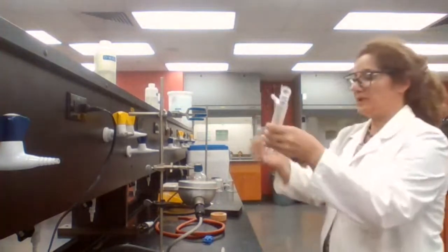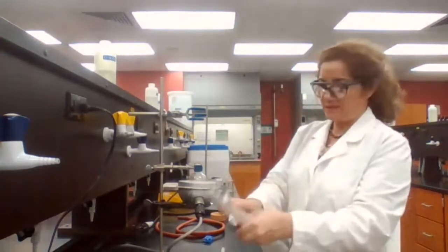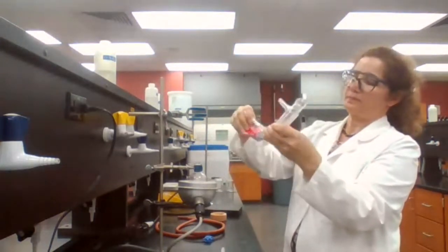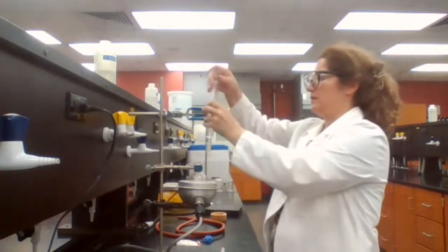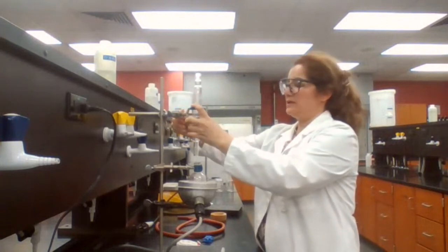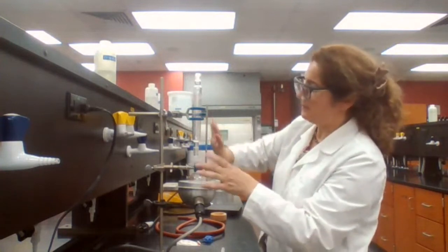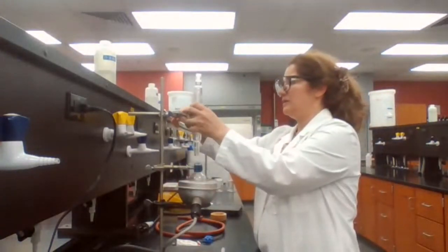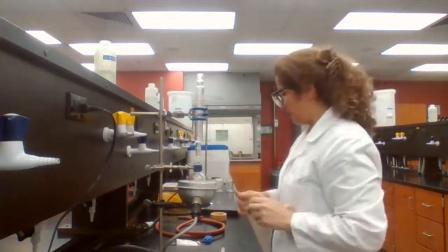For the glass joints, we want to make sure that all the glass joints are greased. So I'm using vacuum grease to grease the joint. I don't want to get the grease into the flask while I'm putting the chemicals in, so I'm keeping it separate. When I have the chemicals in, then I will attach it. So I just want to adjust the length, make sure that it is on.